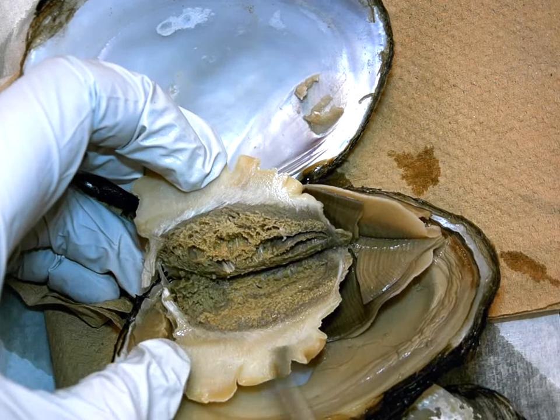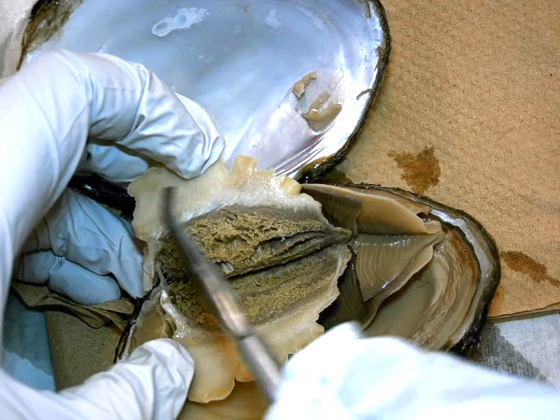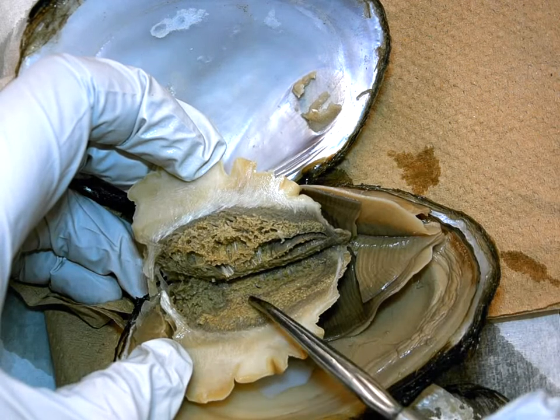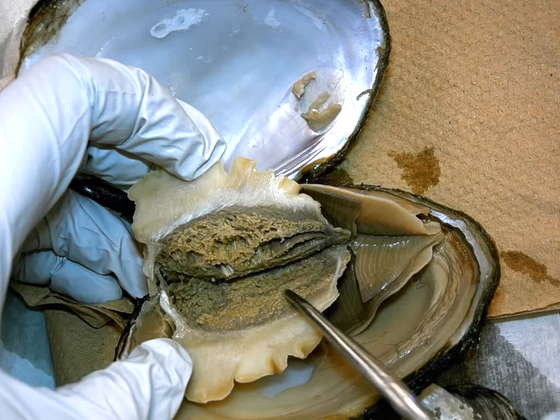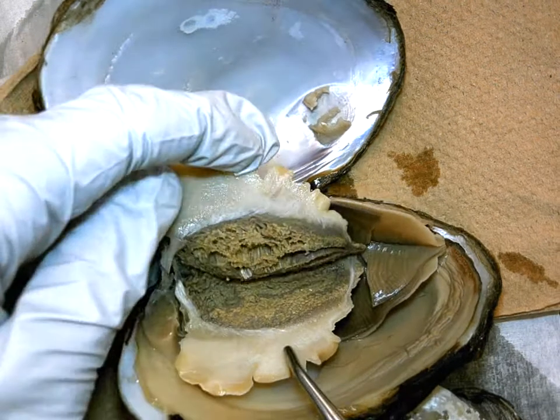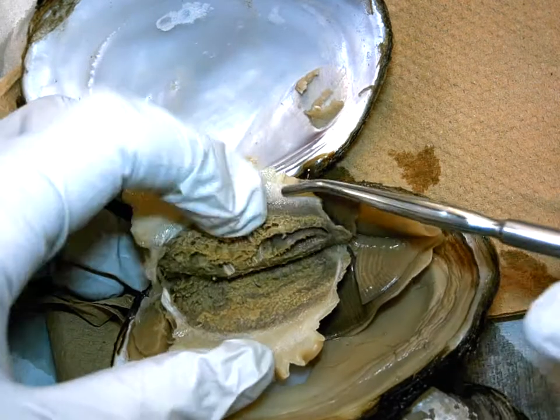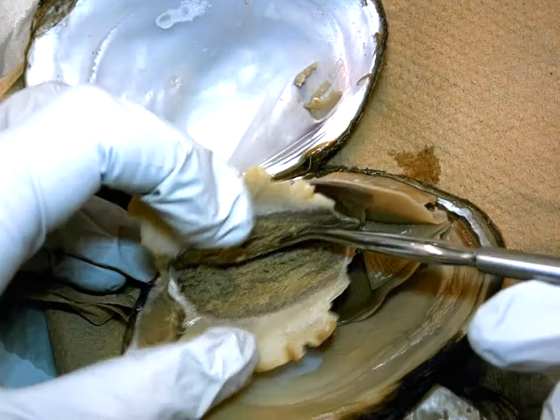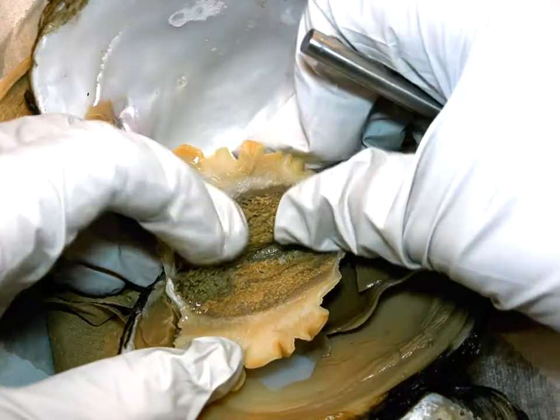So pretty much this area up here, which is just hardened muscle, is the foot, and this circular area here that you see gets kind of soft and gooey and fleshy is the visceral mass. Now the first thing once you open it up that the lab asks you to look for is the wound up intestine, which is coiling through this visceral mass.